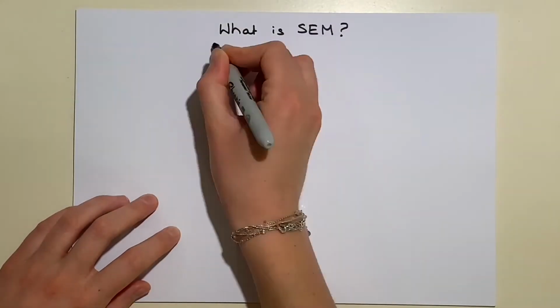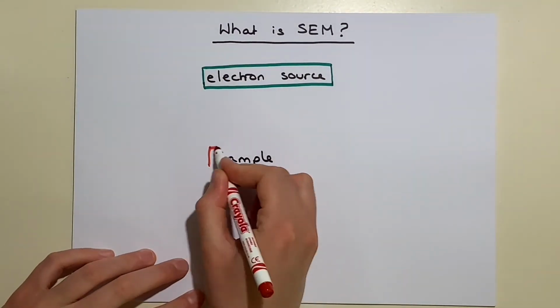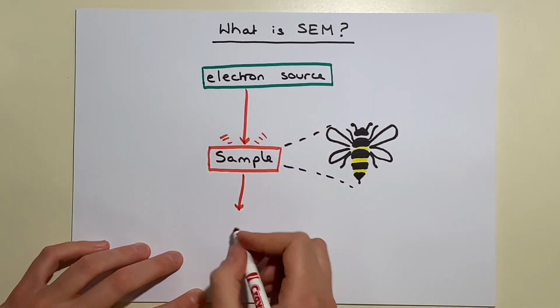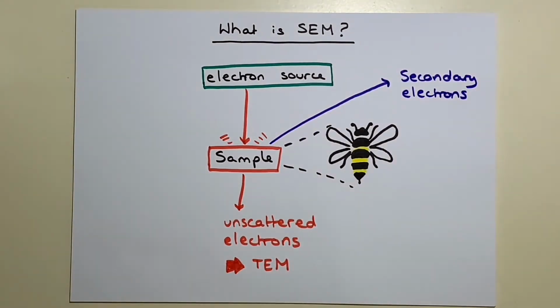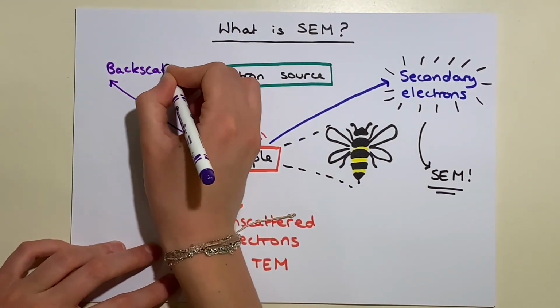When the beam hits the sample, 2 primary signals are created. Electrons can be removed from atoms in the sample, releasing them to the detector, giving strong signal variation with surface topography, or electrons from the beam can be reflected by the sample, which give an indication of the elements present. X-rays are also released, which give further information about the atomic composition.